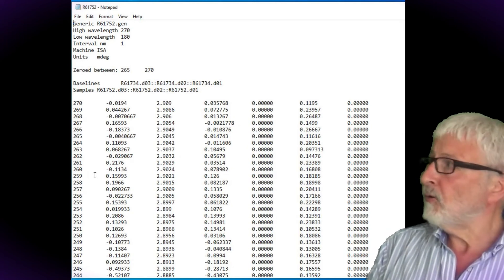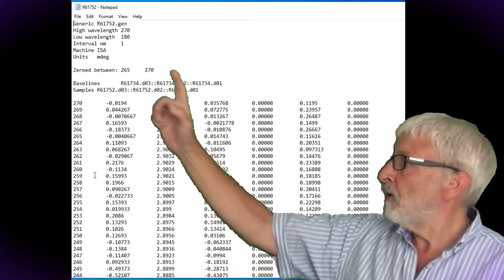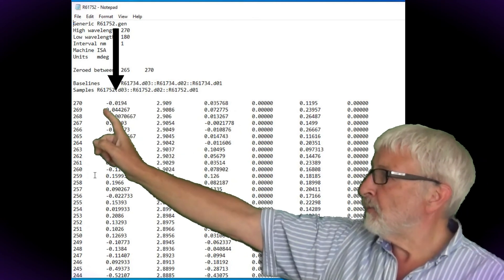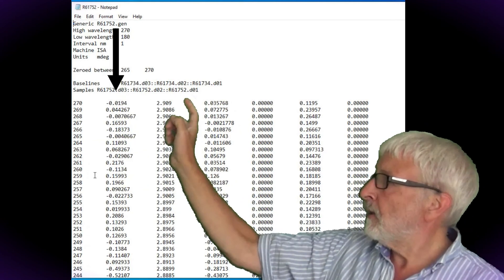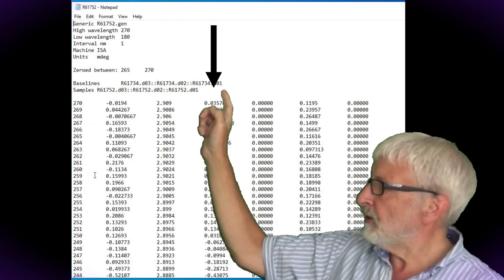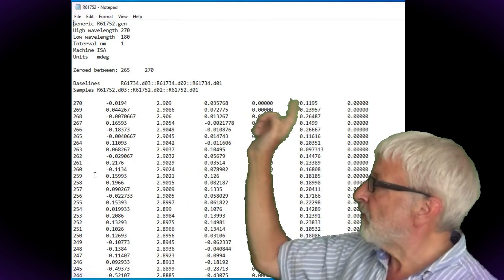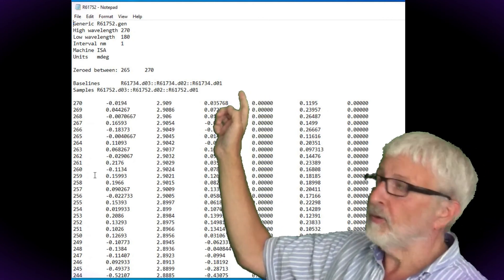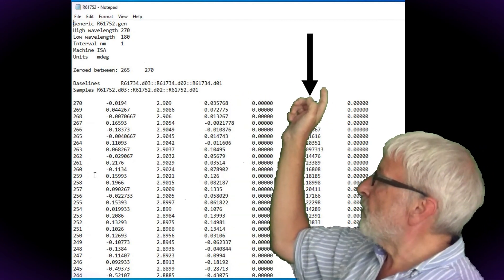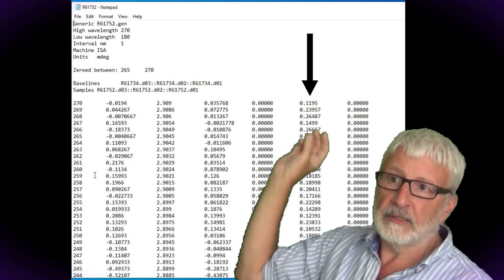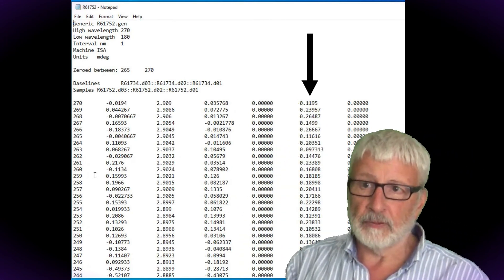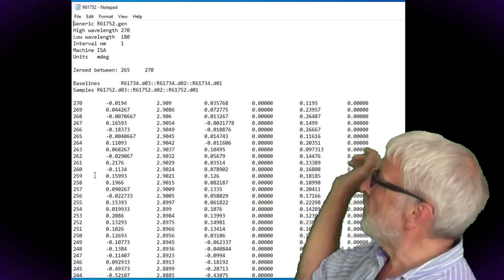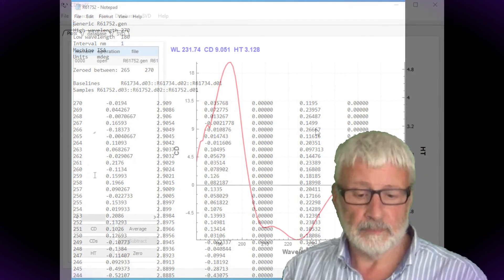The data columns are wavelength, unsmooth CD data, HT signal, smooth CD data. The fifth column isn't used in this particular version of the program. The sixth column is the error and this is a standard deviation between repeat scans of both sample and baseline. This final column isn't used either.